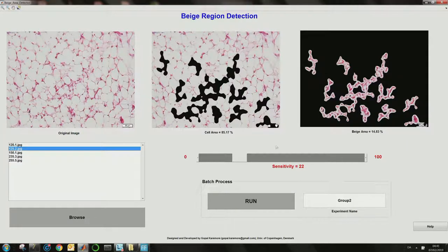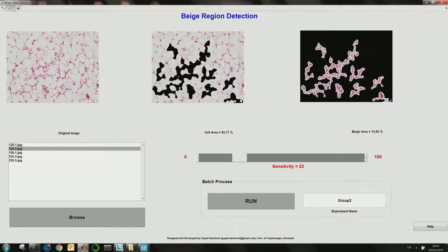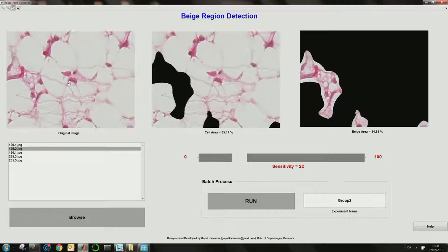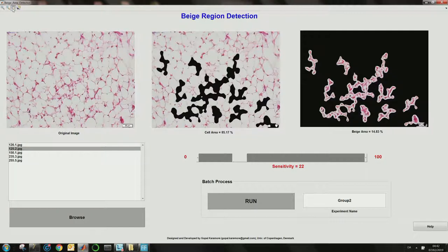You can also zoom in on a particular location by drawing a rectangle — this will be linked to the other two windows so you can study which region has not been segmented well and adjust the sensitivity accordingly. You can zoom out, pan the view, and right-click to reset to the original view. Click the pan view again to exit the zoom mode.